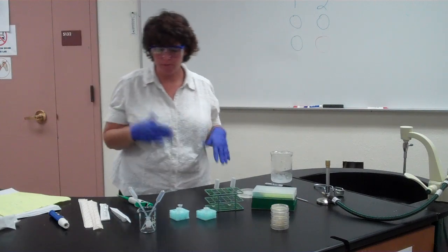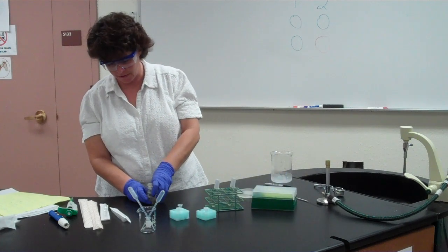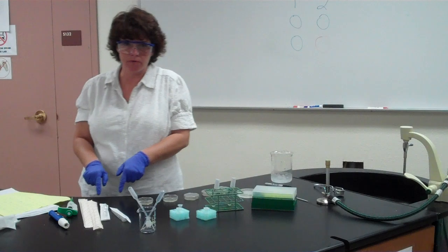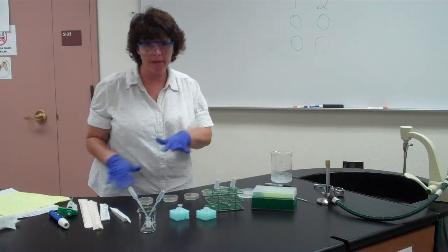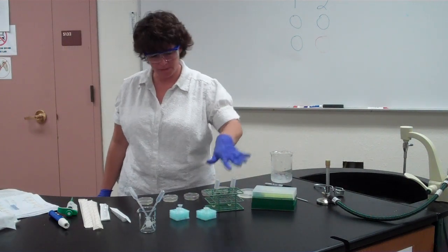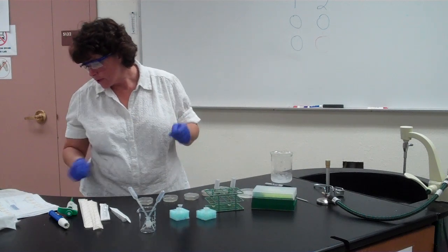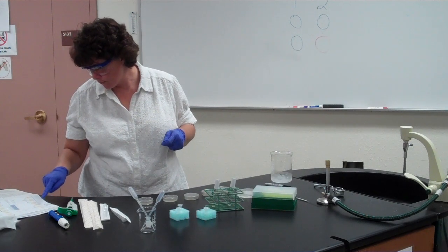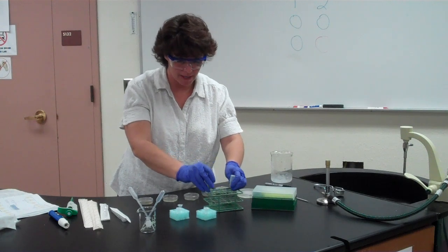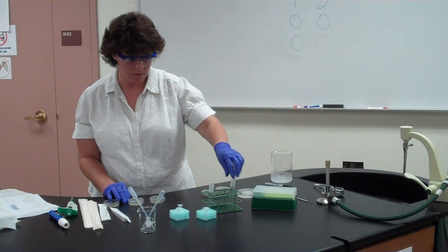During that 10-minute recovery period, prepare your plates. Flip all 10 plates so the agar is facing down, and arrange them in numbered order — one through ten. Don't leave them haphazardly. Plates one through seven will receive the DNA positive mixture, and plates eight, nine, and ten will receive the DNA negative mixture. Make sure your labels are clear and won't rub off.